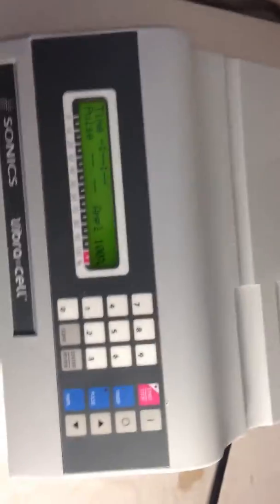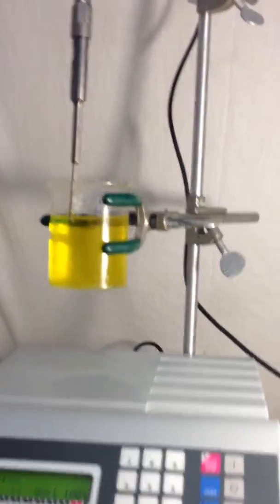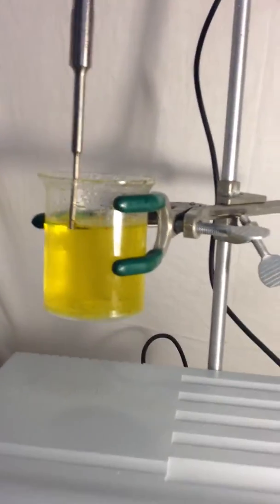You can select different power and pulse settings. Here we have a kind of colored saffron water to see how it's going to show the performance.